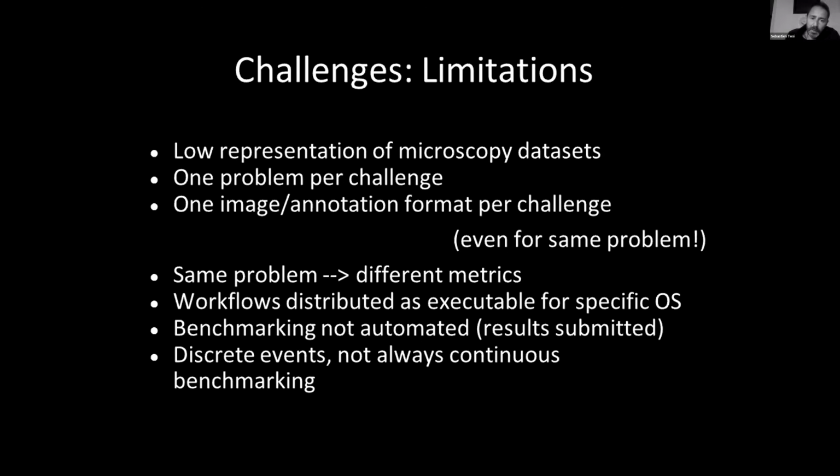Also, the workflows are often distributed as compiled code that you can execute, for instance, on a specific operating system. So it's not reusable in a generic way. The benchmarking is not automated most of the time. So what you submit are the results of your workflows, but they are not automatically evaluated by the system in a reproducible way.